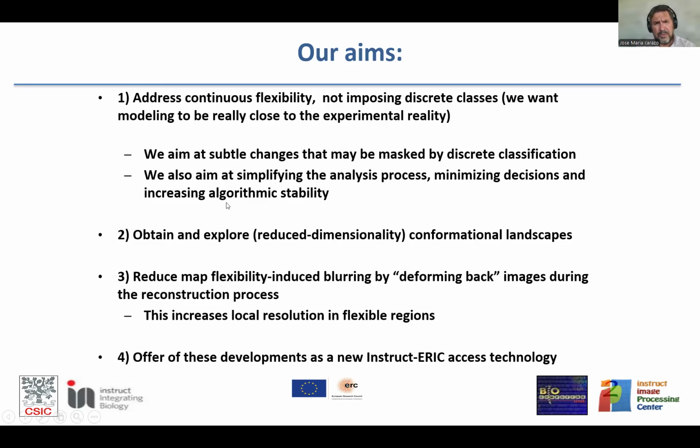So one of the points in my mind was always to use hypotheses about the data, about the processes, that are really pertinent to the data or to the processes. Sometimes you have to put more, but you don't know how to do it. If you don't put this, you will always pay something. Of course, this is going to be complex. We want to explore in a reduced dimensionality way and really increase the capability of deblurring the images from a blur, getting a complete set of different structures.